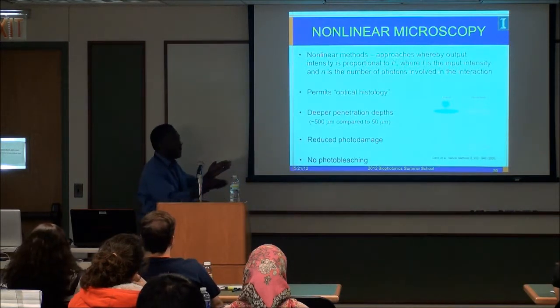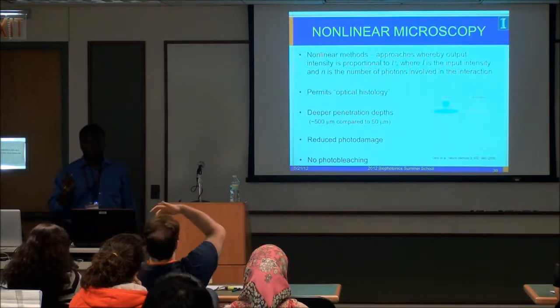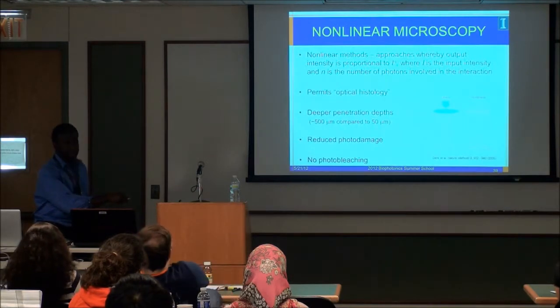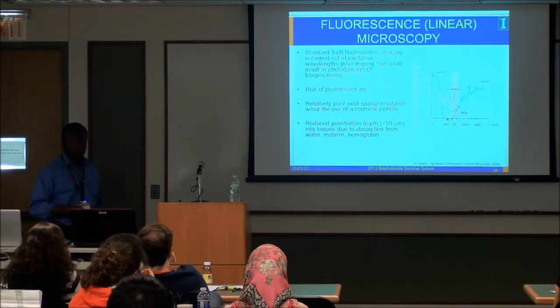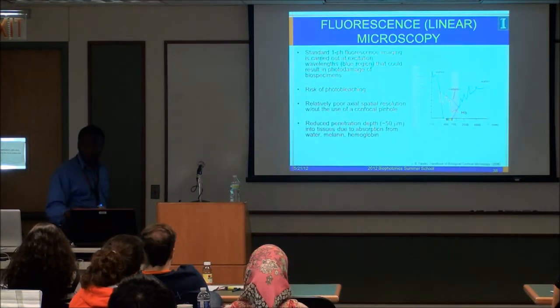But now what this allows you to do is it permits optical sectioning, right? But the more important thing here, even more important than that potentially, is that you're coming in with red light or redder light. And what I said earlier from the red light picture is that we have this therapeutic window. So that now allows deeper penetration depth, even though the photons that are created are going to undergo this absorption and scattering effect that you don't want. Okay?